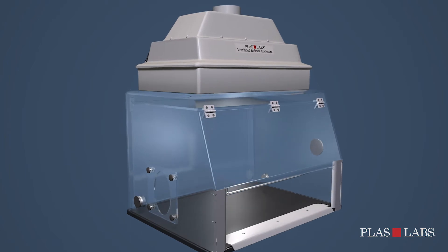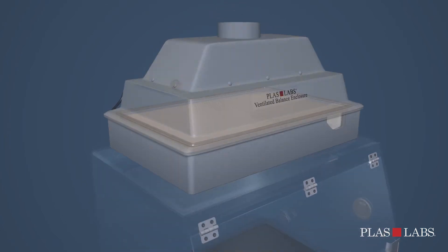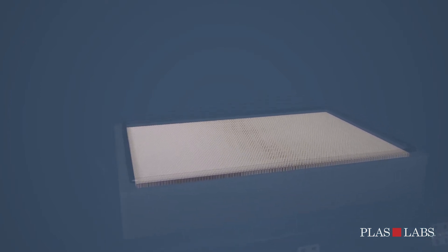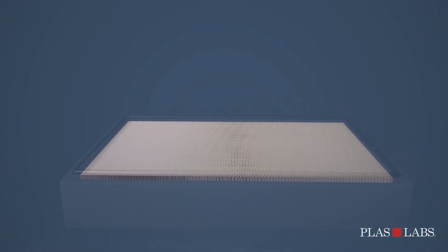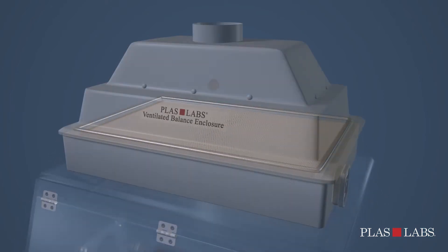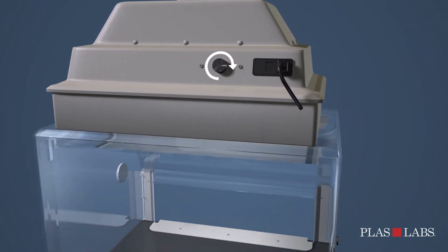The top housing on the ventilated balance enclosure features HEPA filtration with upstream downstream polyurethane gasket, 100 mm thick pleats requiring fewer filter changes, and rated 99.995% at 0.3 microns efficiency.